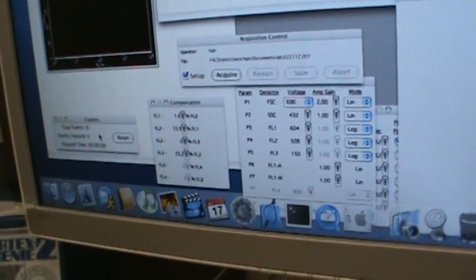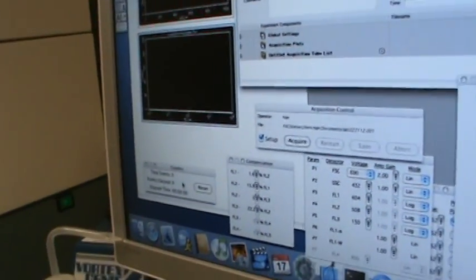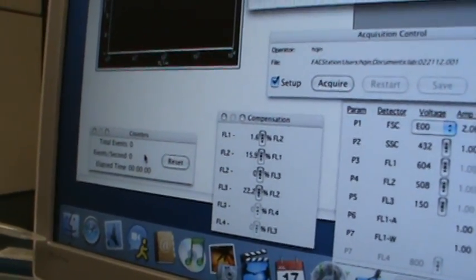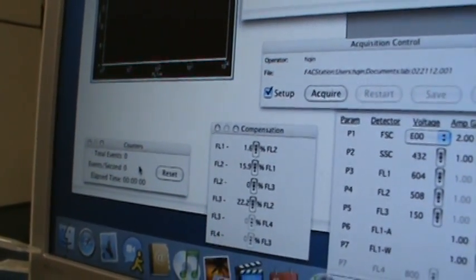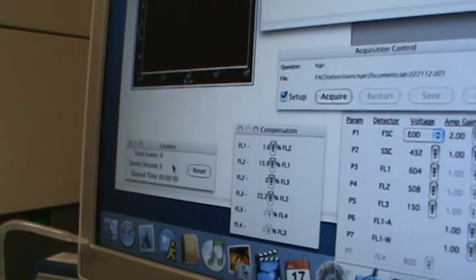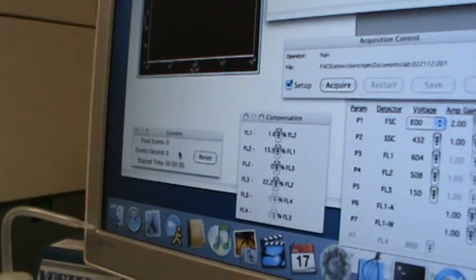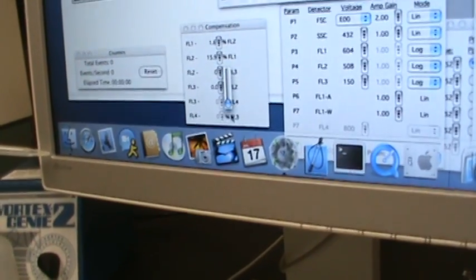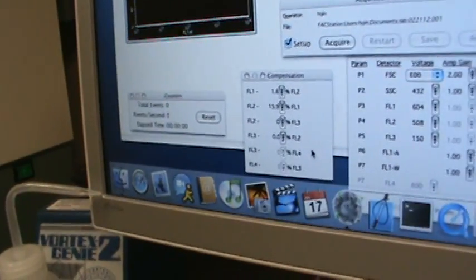Okay? Can you explain how to adjust compensation? Okay. No, I can't. Scientifically, it's very difficult. But practically? Practically, we use compensation when you know that your fluor bleeds into two particular channels, and then one will benefit from the other. That's the best way I can explain it. So it's a little bit of trial and error with compensation. You know that you will not have an FL3, so you shouldn't even be using the channel for FL3. You should only be using FL1 and FL2.